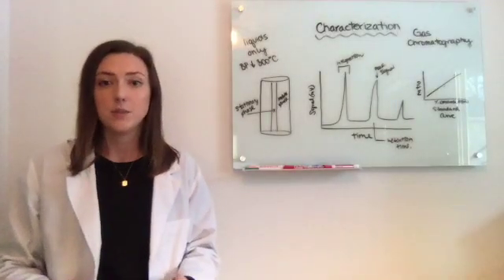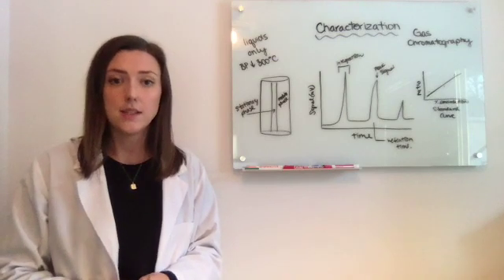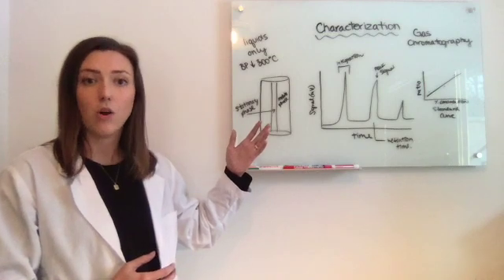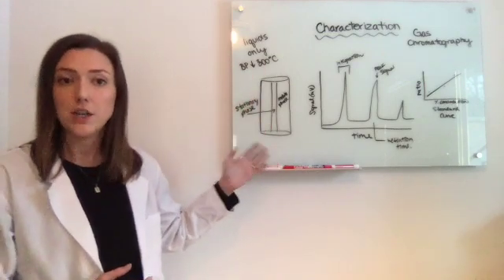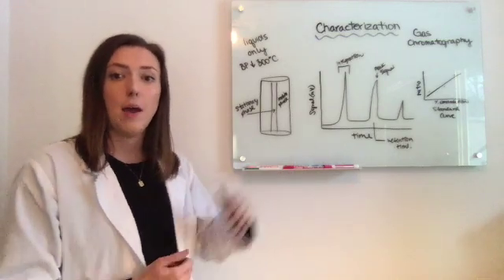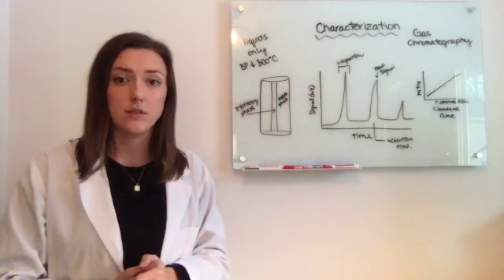So last but not least, we have gas chromatography for liquids with a boiling point below 300 degrees Celsius. Just like in TLC, we have a stationary phase and a mobile phase, only here we're using a metal column and seeing how quickly the liquid travels through the column. That is called its retention time, and it is directly related to the identity of a substance, whereas the integration and the peak signal are related to the amount of the substance present.